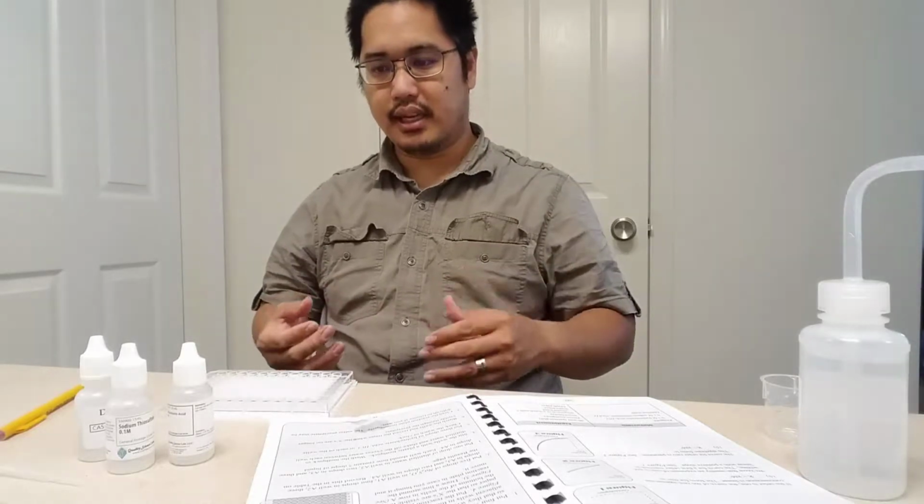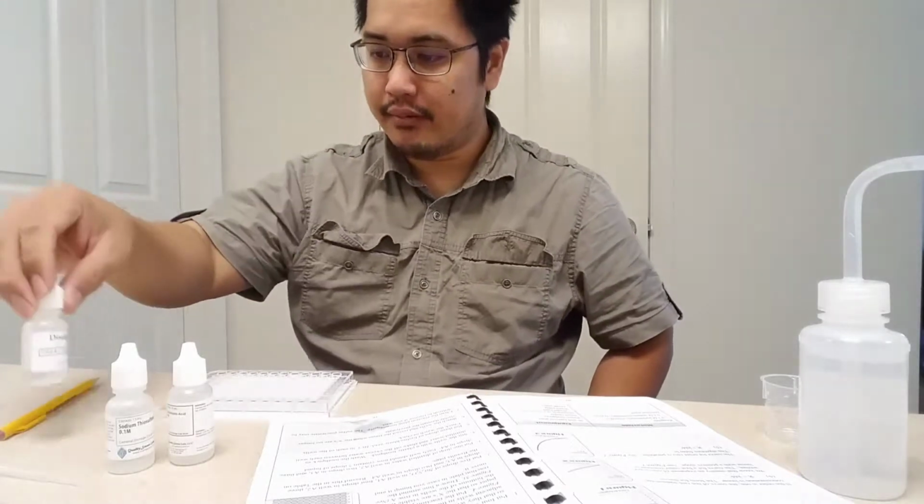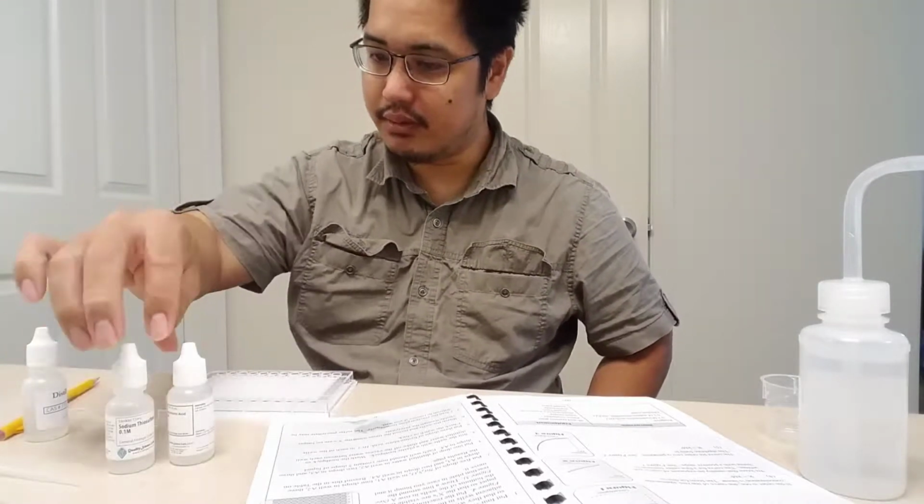And so the experiment is going to be to measure how long this takes. This is all about timing, so you're going to want to have your stopwatch ready. I don't have a stopwatch here because I'm not doing the full experiment. I'm just showing you how to set it up. If I had the stopwatch, that means I'd be doing the experiment. I want you to be able to do it yourself.